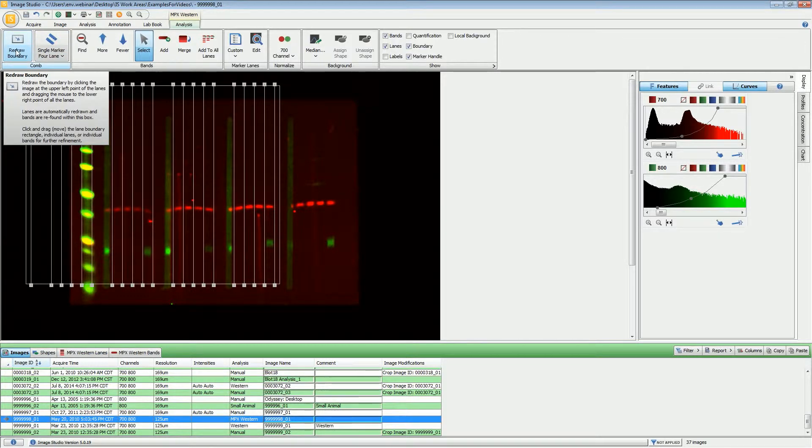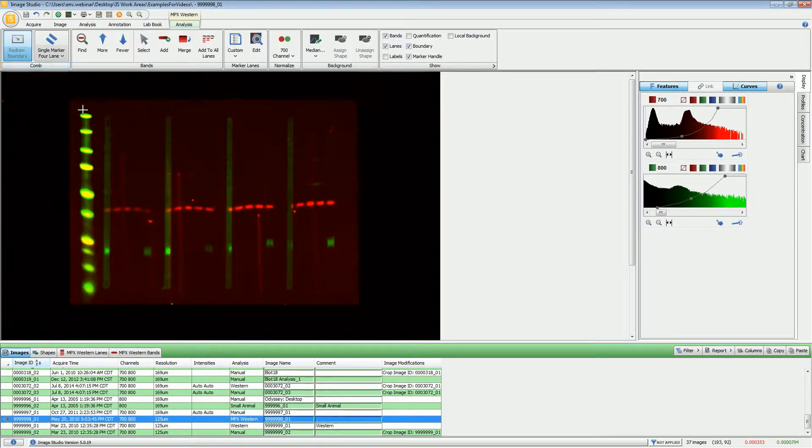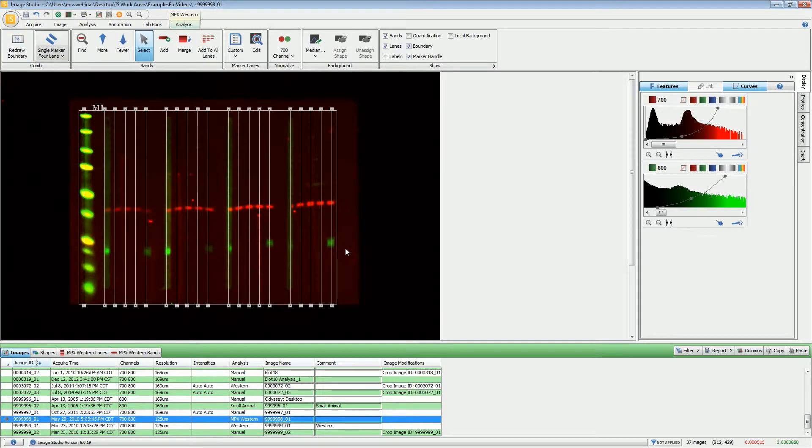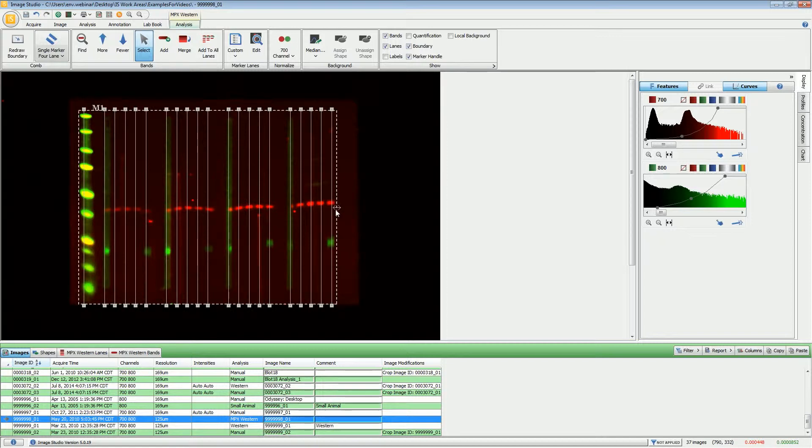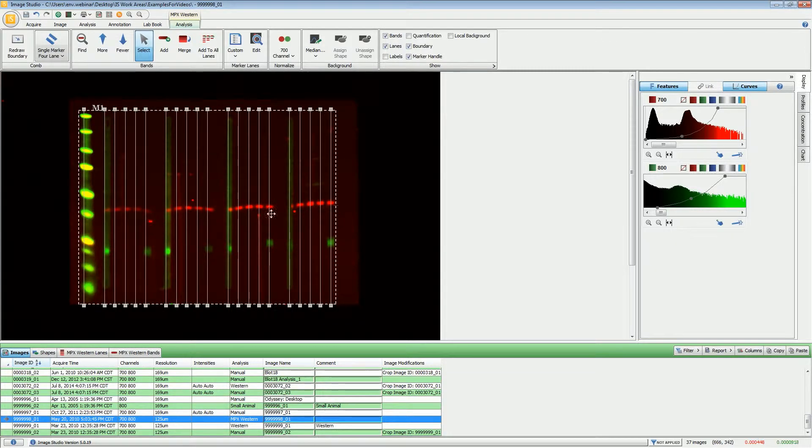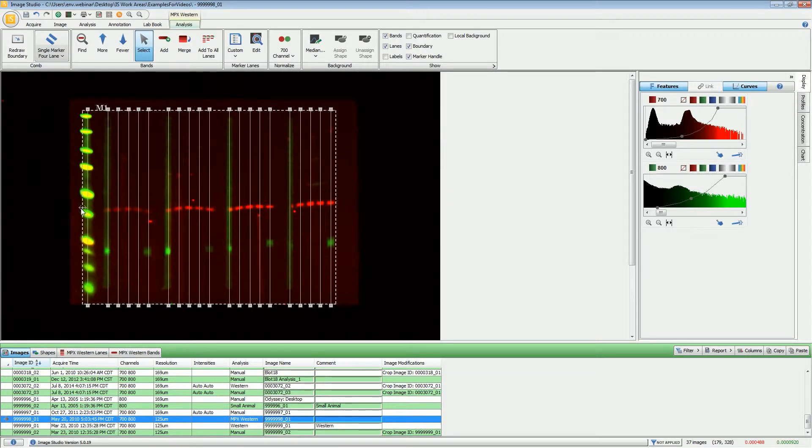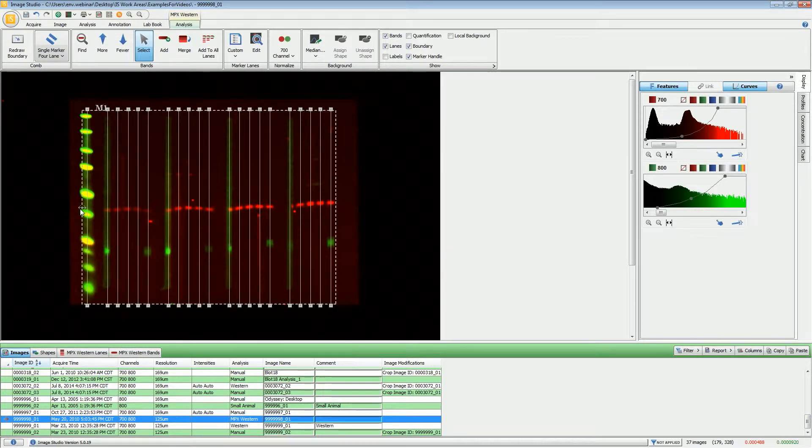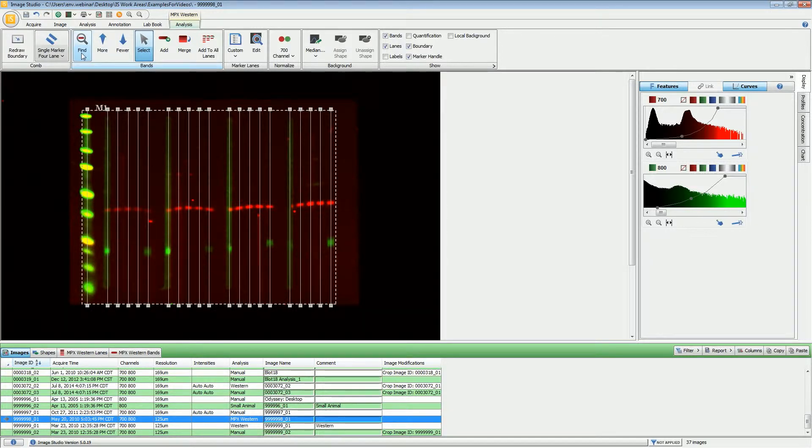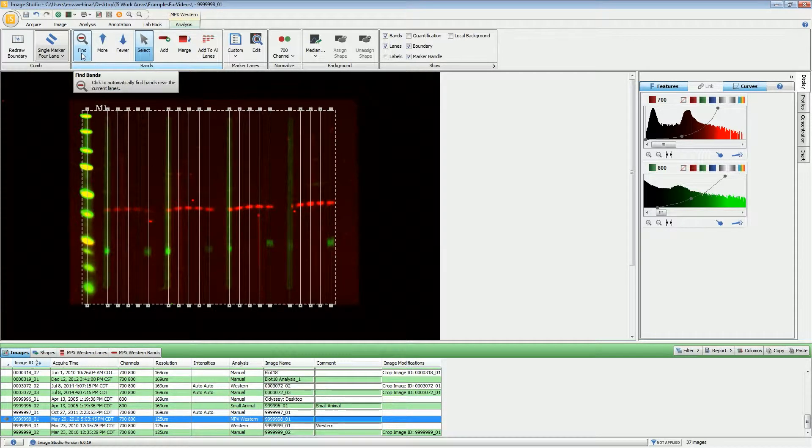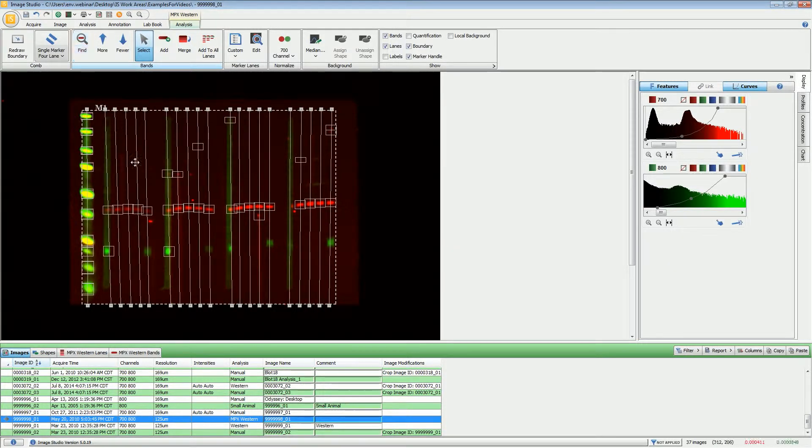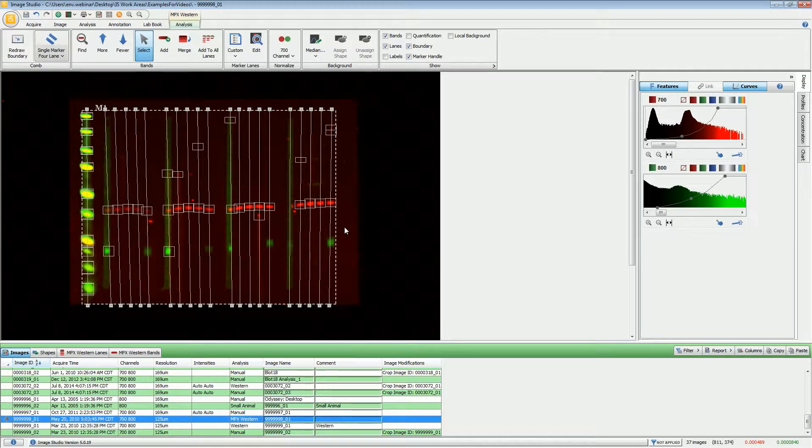I'm going to click Redraw Boundary. You want to draw the boundary just to the outside of your outermost lanes. Once the lane lines drop down, you want to try to get these lines going somewhat through the center of the bands. You can do that by adjusting the border. Once you have that in the correct location, you don't have to worry about them going directly through the center because when you click the find button under the bands group, the lane lines will be moved into the correct location.